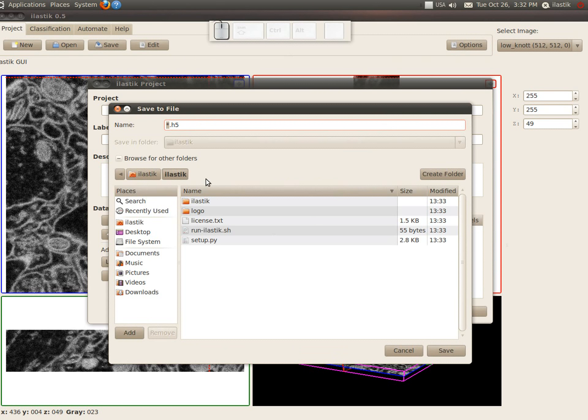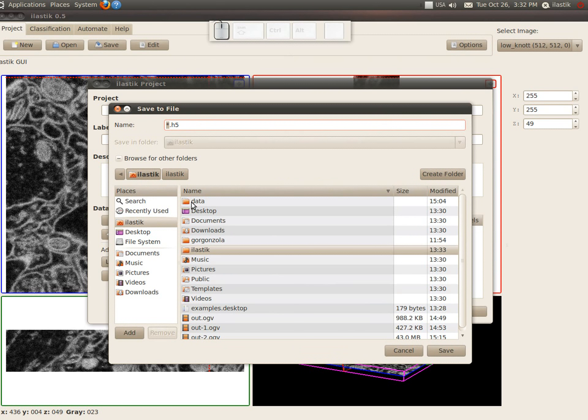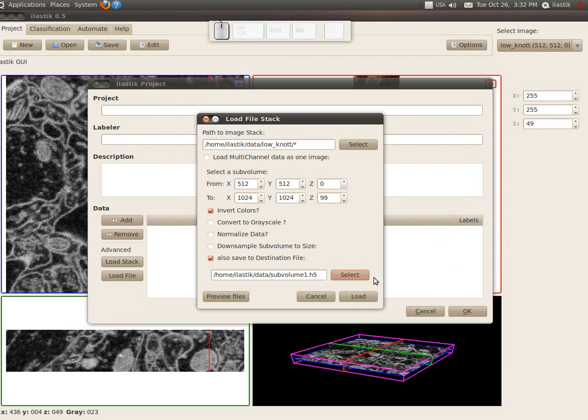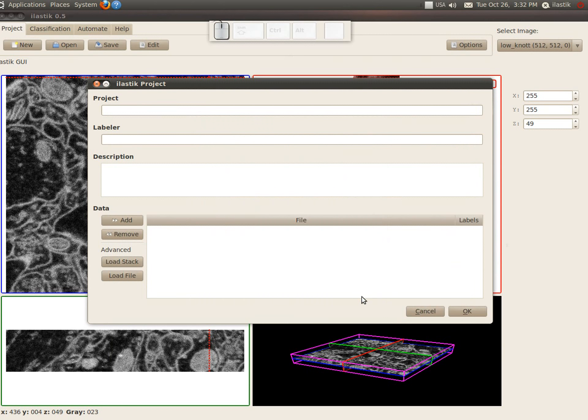So let's use this option and go to my data directory and save it there as, for example, subvolume1. And let's load what we have.